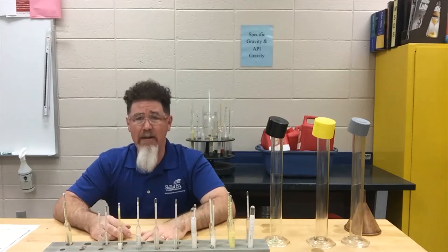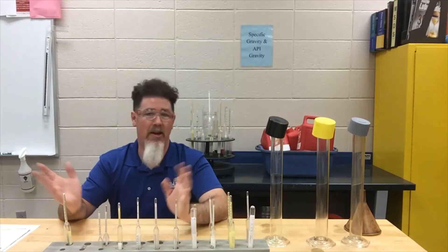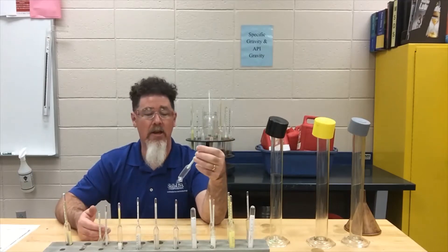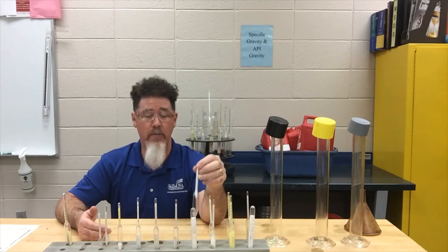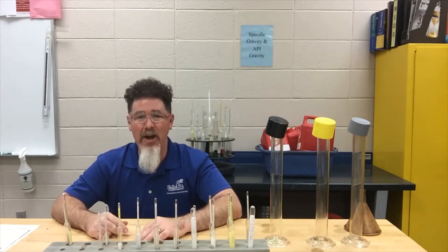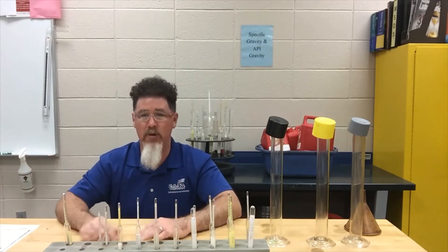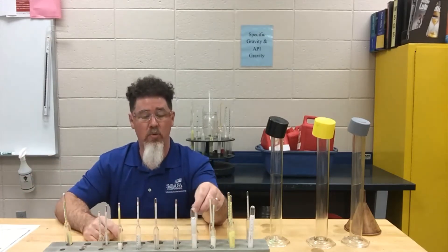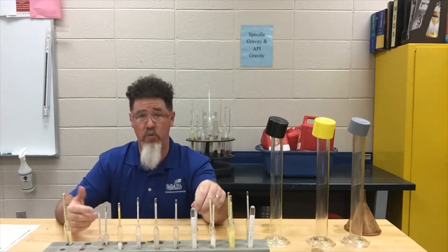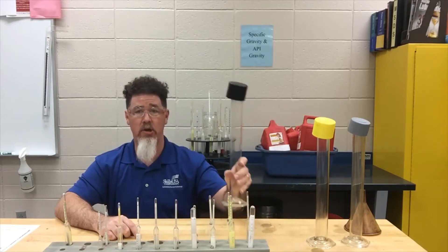When measuring gravities there are two ways: specific gravity and API gravity. When you buy a hydrometer it's going to be either a specific gravity hydrometer or an API hydrometer. People ask why there are two ways — it's like driving on the left or right side of the road, both are done around the world. We'll teach you both ways, because which one you use depends on which hydrometer you have. To get started, we'll take some fuel samples and put them in our containers.